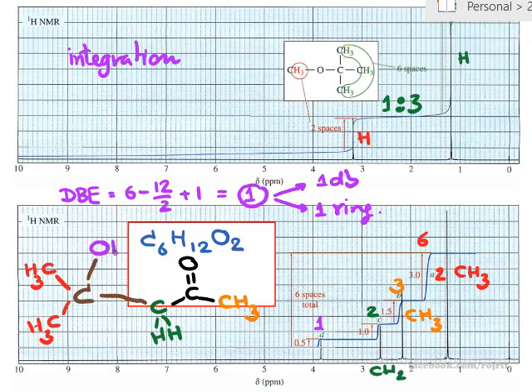So that means at the end, this H in purple color belongs to OH. Right? So it's like Lego, like a puzzle. You have to connect things from hints that are given in the spectrum by the position and by the integration over here. Okay? I am okay. So I guess you have to be okay.